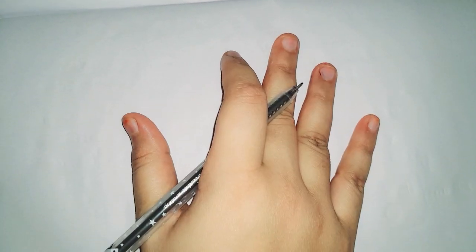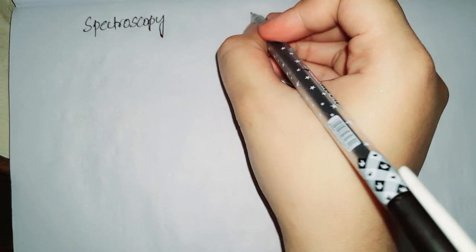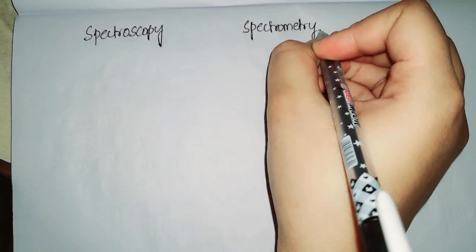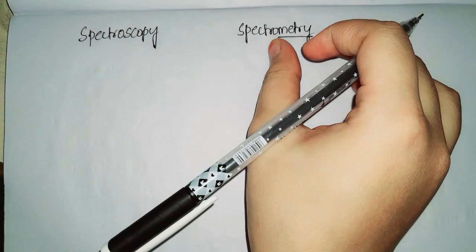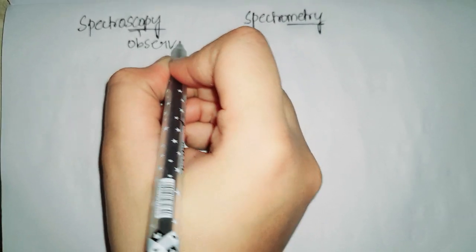Now we'll see two terms, that is spectroscopy and spectrometry. What do you mean by spectroscopy and what do you mean by spectrometry? By the metry we can understand we are measuring something. By scopy we can understand we are observing something, right?